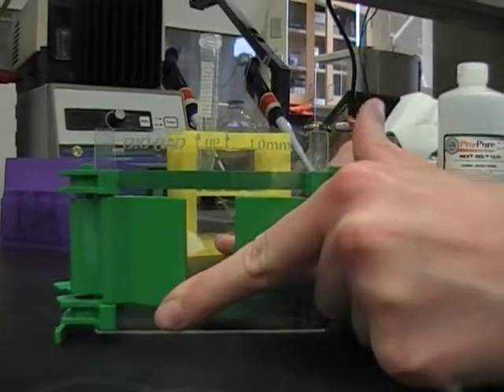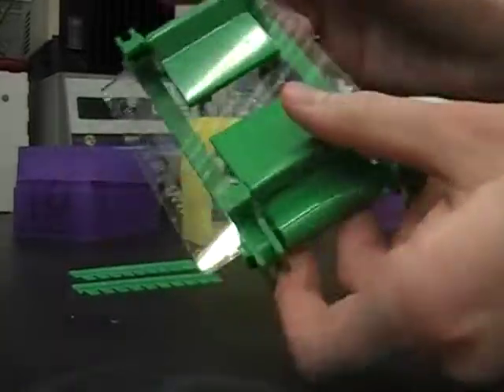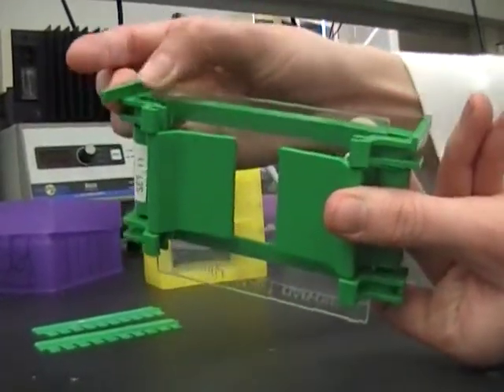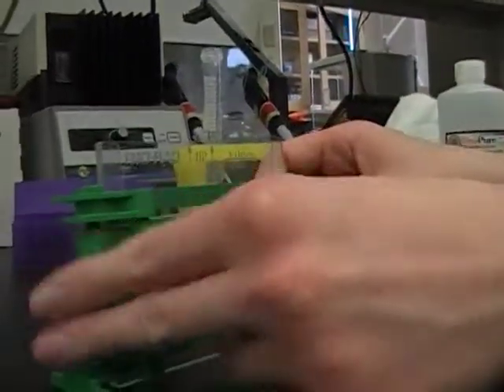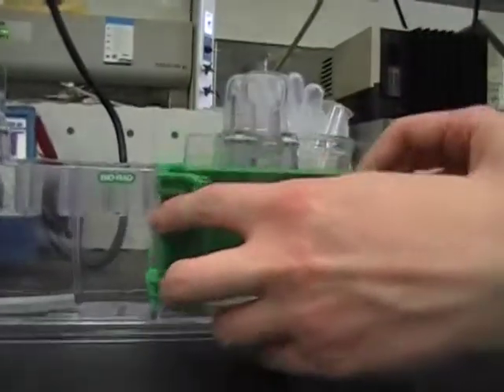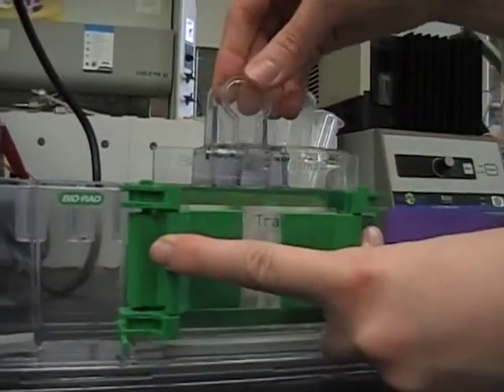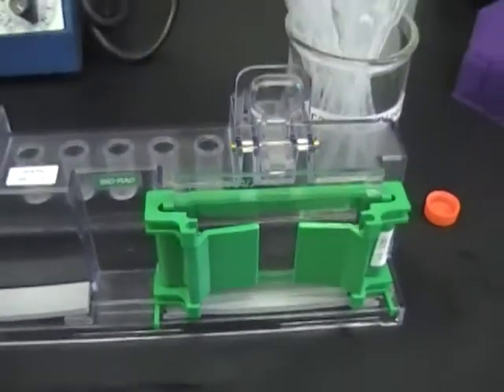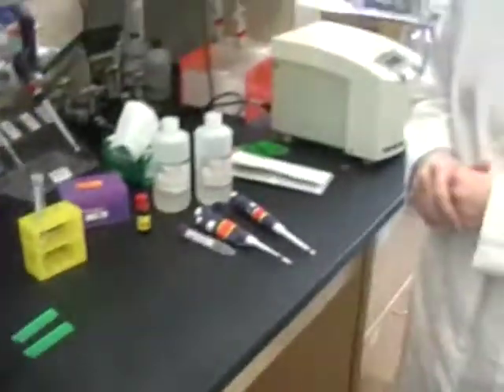Take the clamps and fasten them down. You can run your finger across the bottom to make sure that it's nice and smooth and you have a tight fit. Then lift up the clamp and secure the gel to the cast. Once we have our gel set up, we're ready to make up our gel casting solution.